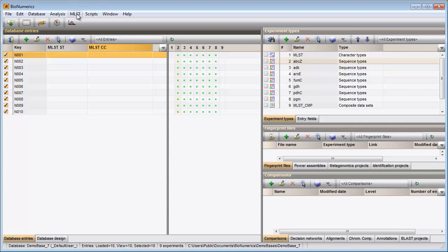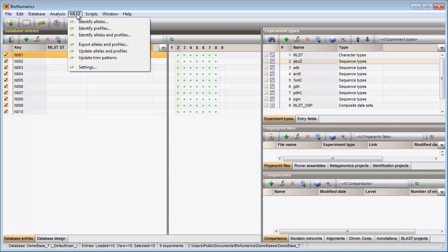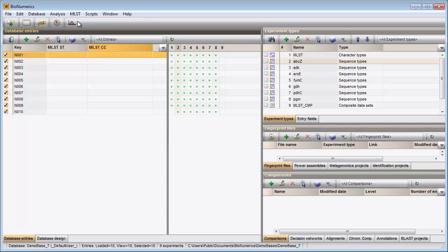I select MLSD, identify alleles. The matched allele IDs are stored in the corresponding character fields of the MLST character type.